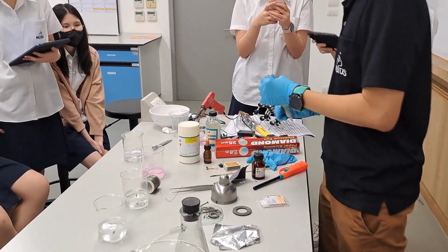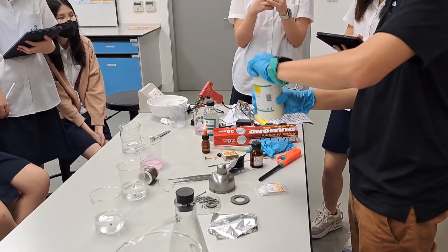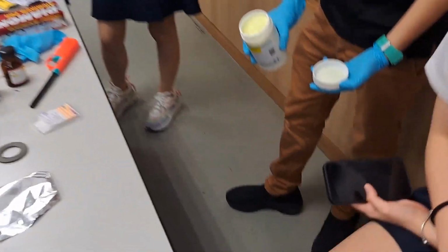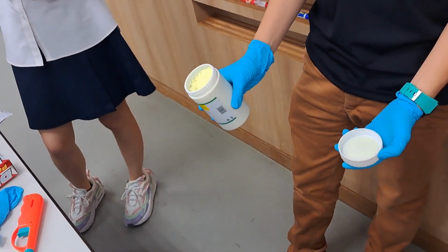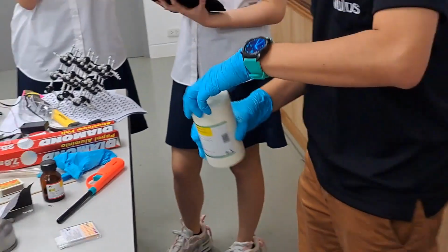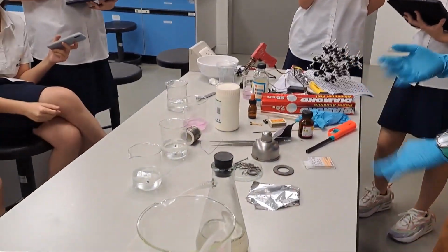Okay, alright. And this is sulfur. What color is solid sulfur? Yellow. And it is very toxic, so let's keep it in there and don't burn it. More toxic than the gas outside. Sulfur dioxide.